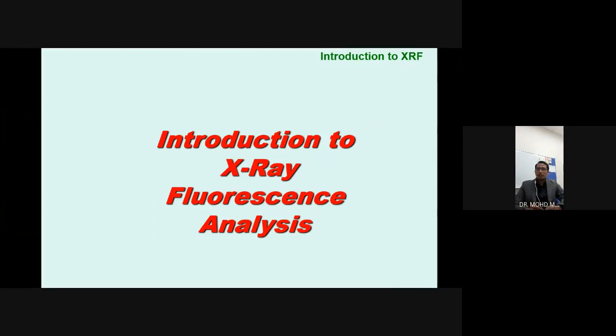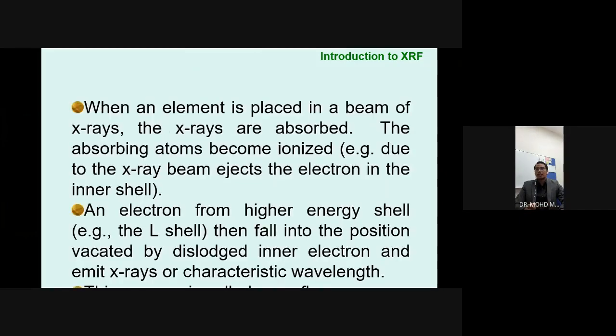Today we continue our lecture on X-ray fluorescent analysis. As I think everyone is aware, we are now moving to another chapter, which still utilizes X-ray as the source of the main characterization technique. X-ray fluorescent analysis is also what we call the X-ray fluorescence spectrophotometer. That is the instrumental basis. By principle, XRF will tell us about the elemental composition of a material.